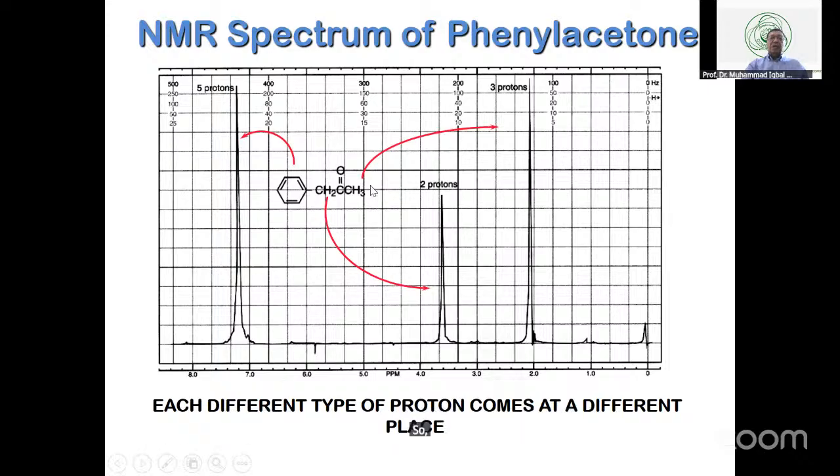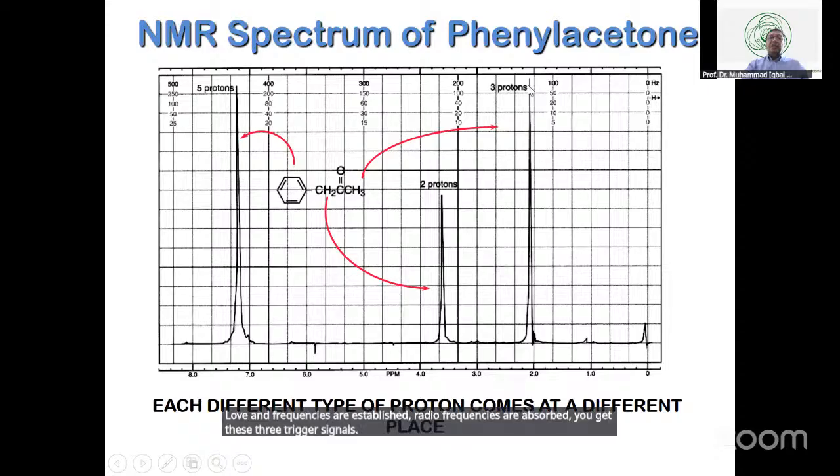So, you place your sample of this molecule, and resonance frequencies are established, radio frequencies are absorbed. You get these 3 signals.